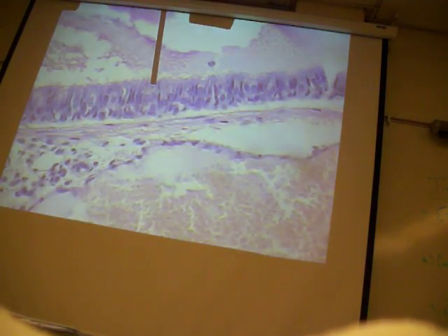Your eustachian tube. Where have we heard eustachian tube before? That's the connection between your middle ear cavity and your throat. What is your eustachian tube derived from? You got it, pharyngeal gill pouches. So they're pseudostratified right there.